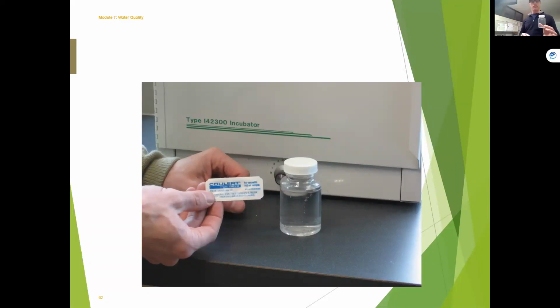I'm going to show you two different styles of microbiological bottle. You can see this one here, it's sealed. It's got a ring around it. At no time, though, do you want to put your fingers in this area here. I always keep it down low, and I take one hand and take the seal off of it. So I'm ready to go.